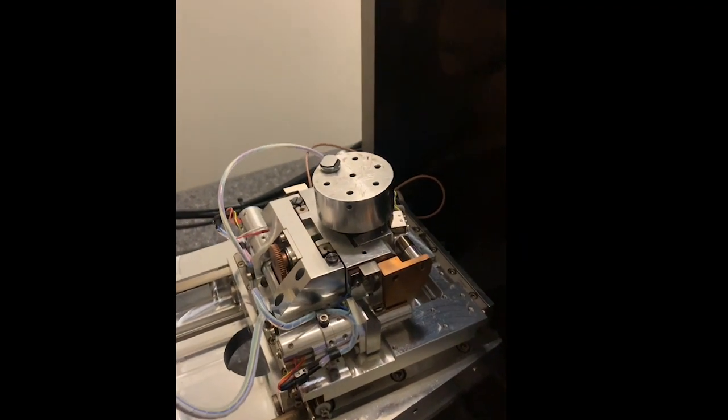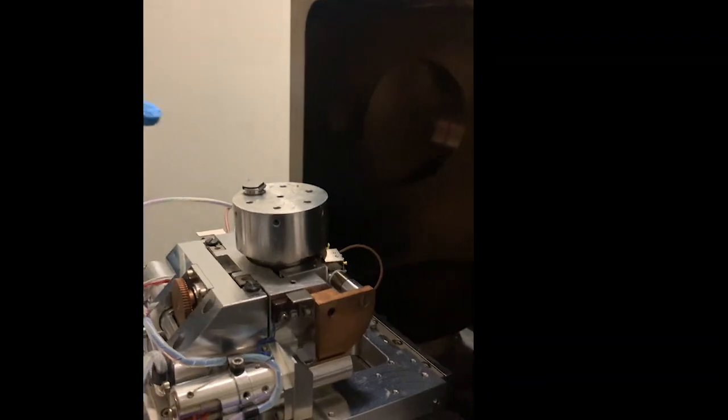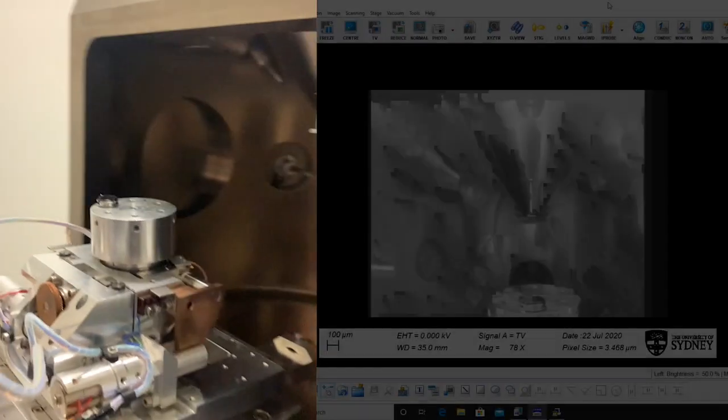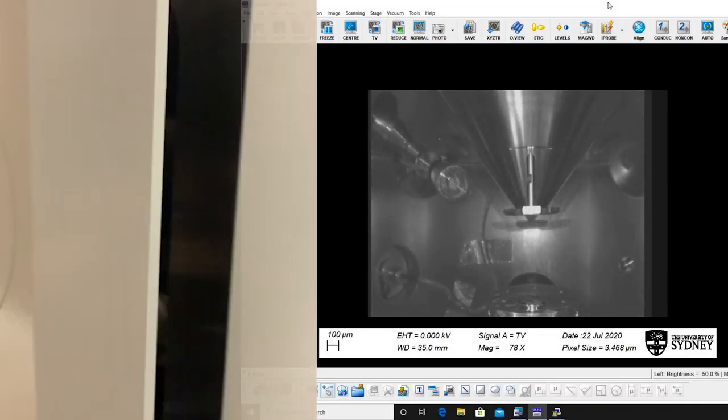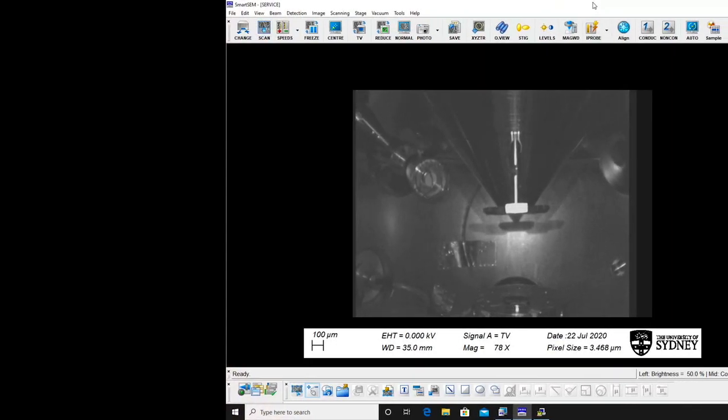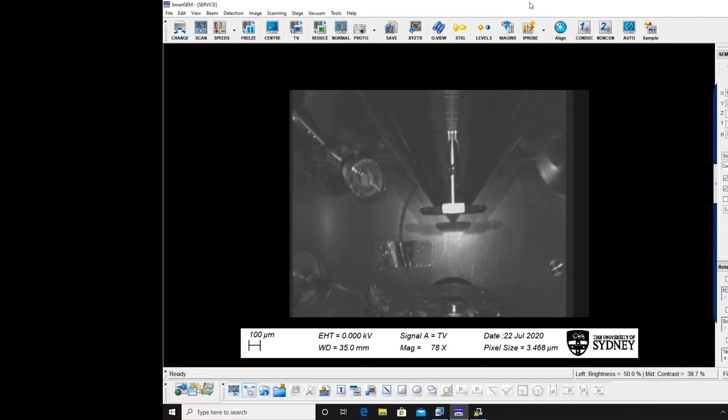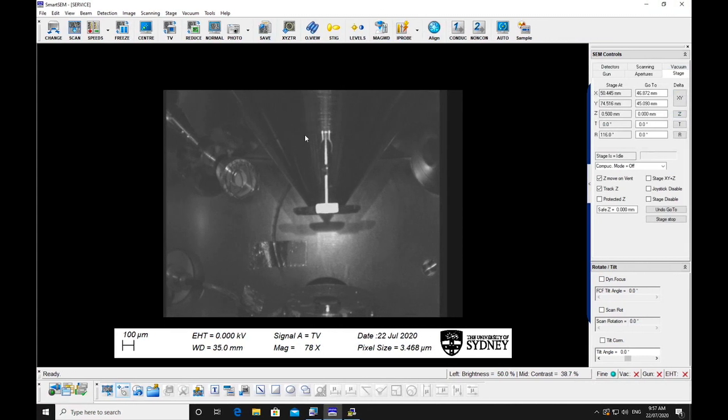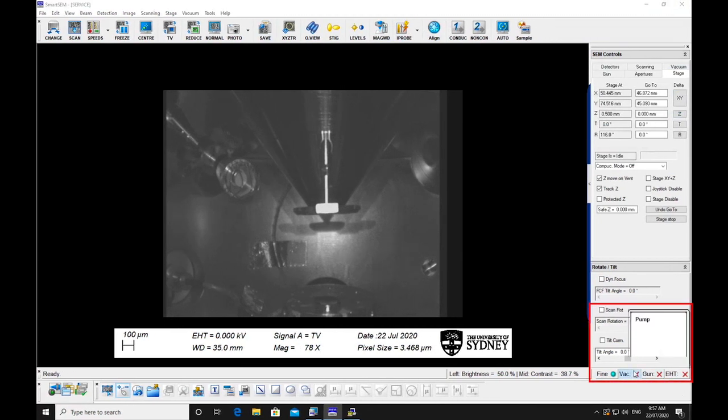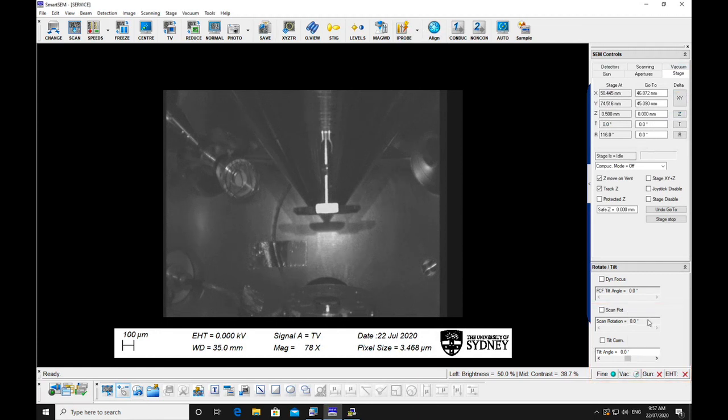Carefully close the chamber door while watching the live chamber view on the monitor to make sure the stage and specimens are not going to hit the column or EDS detectors. Try to minimize the time the chamber is open to maintain a clean system and shorten pump down times. Remove gloves.